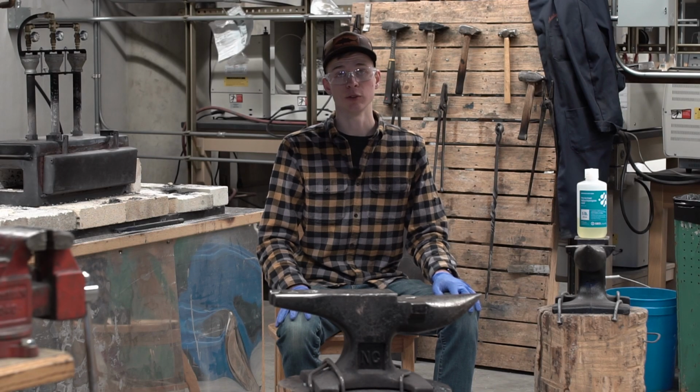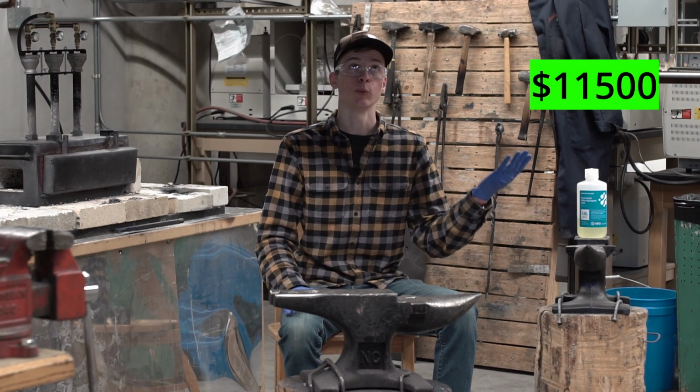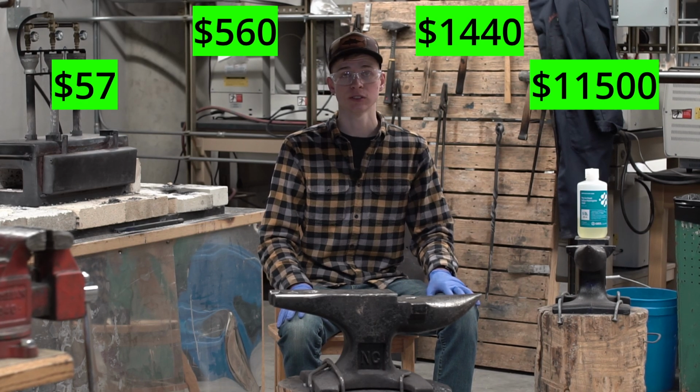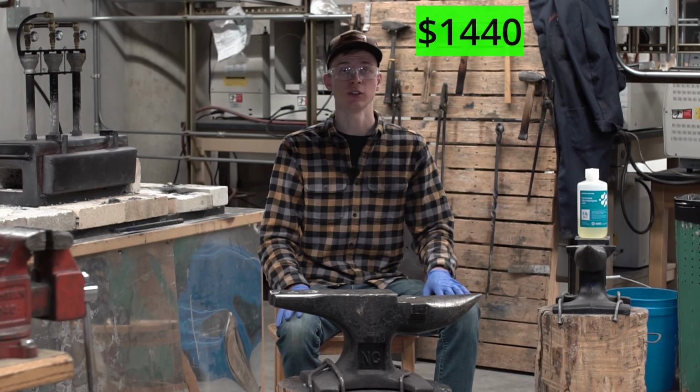The main drawback of using sodium polytungstate as a dense media is the cost. How much do you think that this sodium polytungstate cost? 5 pounds. If you guessed around $1,440, you'd be right.